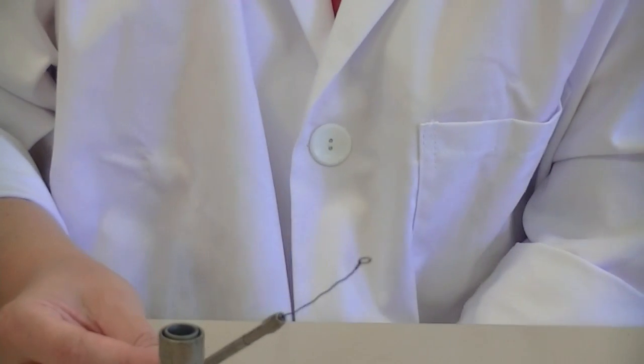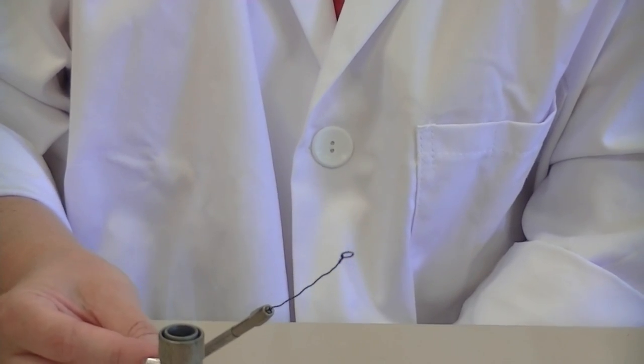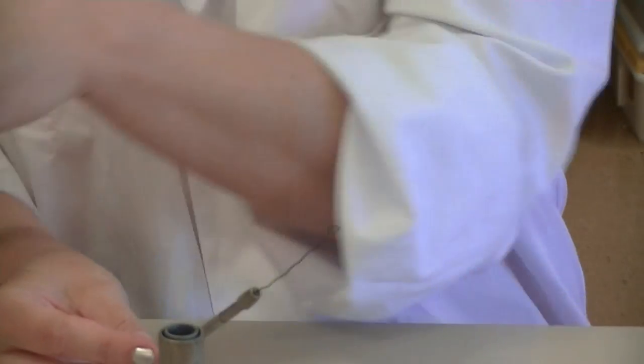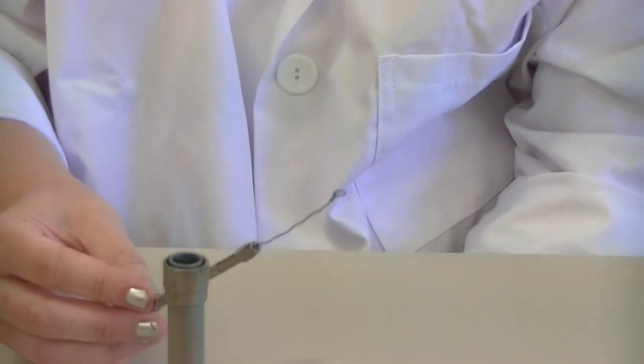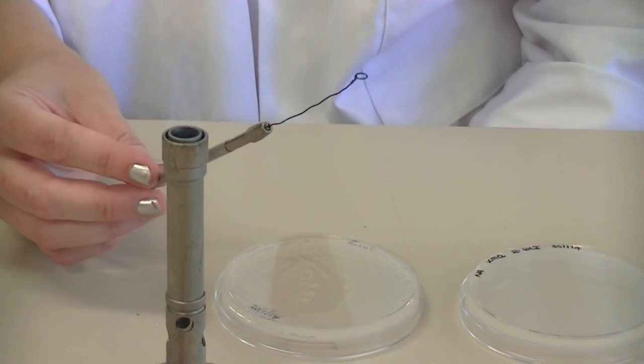Once that's sterilised, you need to let it cool for a few seconds — just hold it near your Bunsen flame. A way of determining whether the loop is cool enough is to actually touch it to the agar surface of the plate.